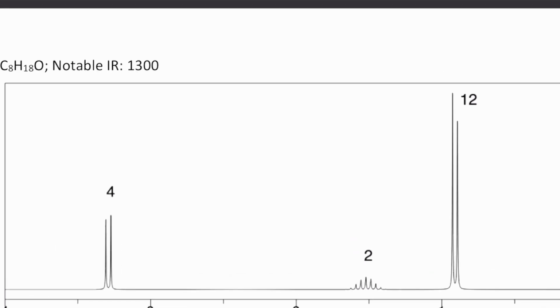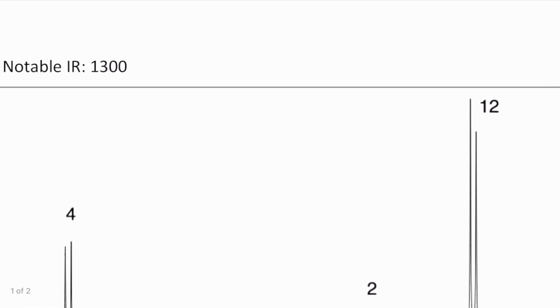And before we tackle the practice problems, there's a few things I want to cover about just what NMR is, and it has to do with the shielding effect of nearby atoms, further extrapolating that to functional groups and the effect of those things on hydrogens. Okay, so we're talking mostly about HNMR. CNMR is another thing you'll learn, typically in the second class of the series, and that will be a separate video as well. But right now we're going to focus on proton NMR, H1 NMR.